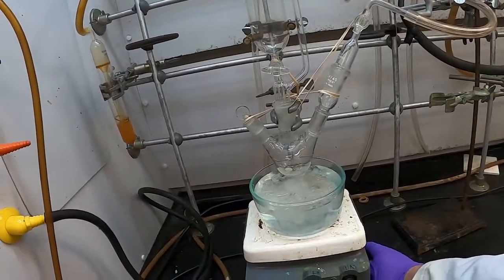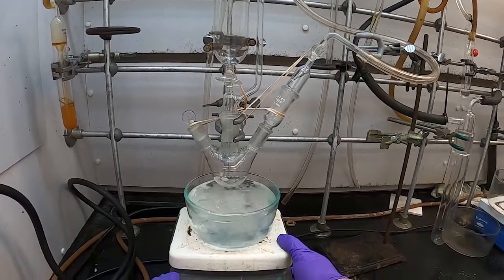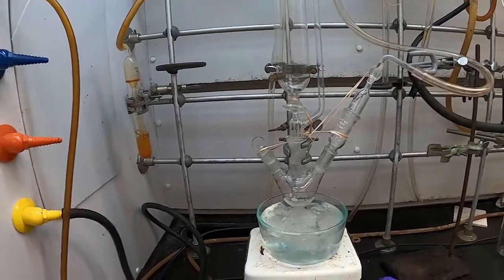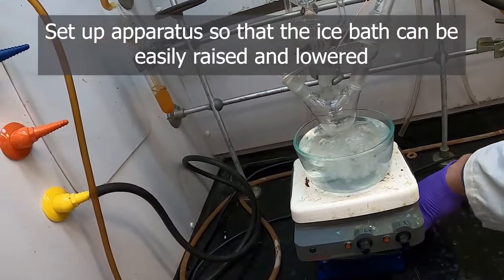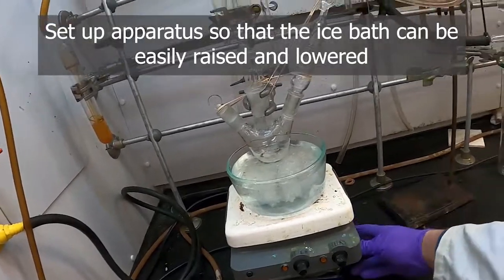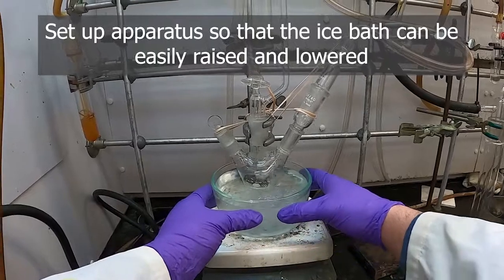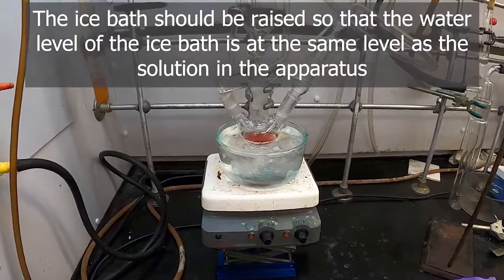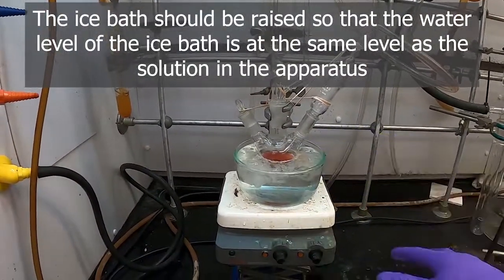One key thing before you start is to make sure that you have your stir plate and things on a lab jack, so that you can raise and lower your bath to your apparatus instead of the other way around. It just makes things easier. And there we go. We've got our bath raised to where the liquid level is level with our red solution.